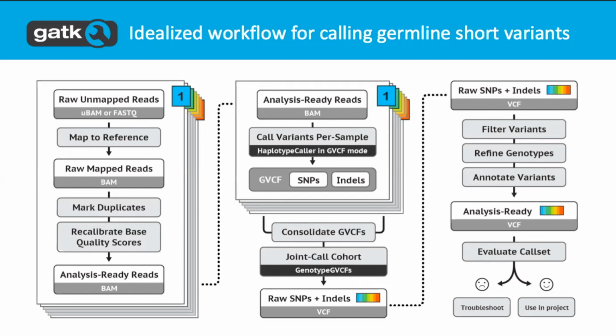The nice thing is that the neural network-based approach should also be applicable for areas that have traditionally been challenging for GATK tools, like non-model organisms, where it's often also a problem of insufficient data or known variants. So there are some perspectives for using the neural networks approach for those use cases. So there's a fair amount happening there. And then I would say the connection to the tertiary analysis of what you do with the variant calls.